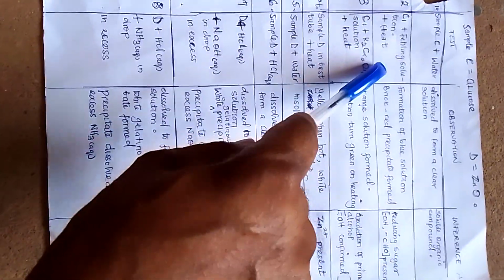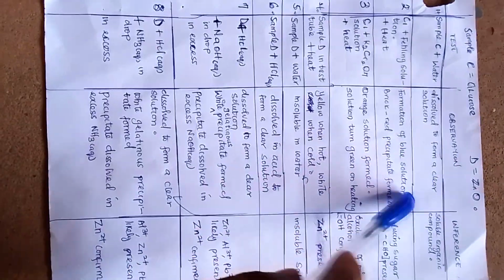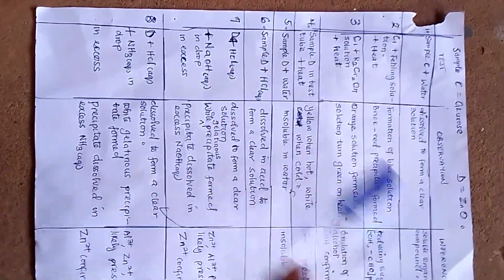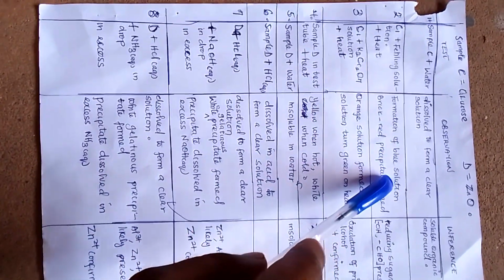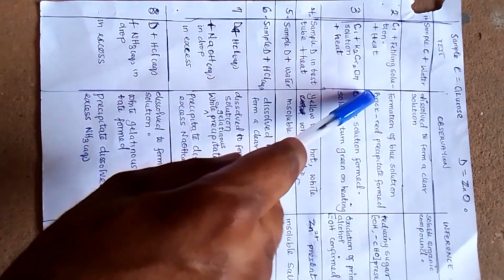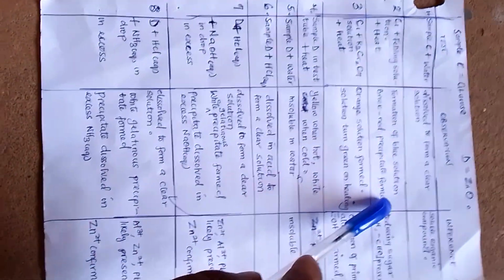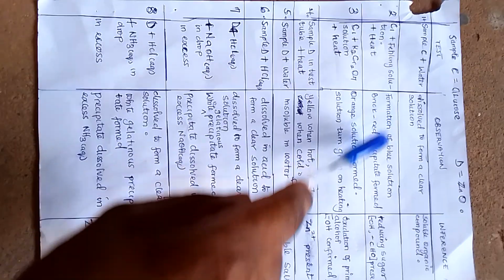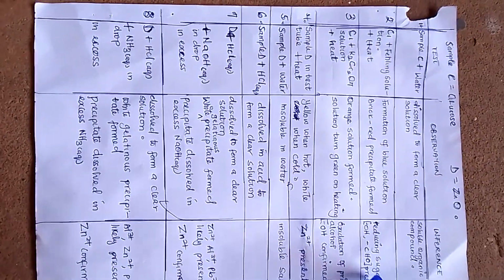So when you add it to that clear solution, first of all you have a formation of blue solution because of the color of the Fehling's solution. So when you heat it, the blue solution is going to change. Under the heat, we are going to have a brick red precipitate form.